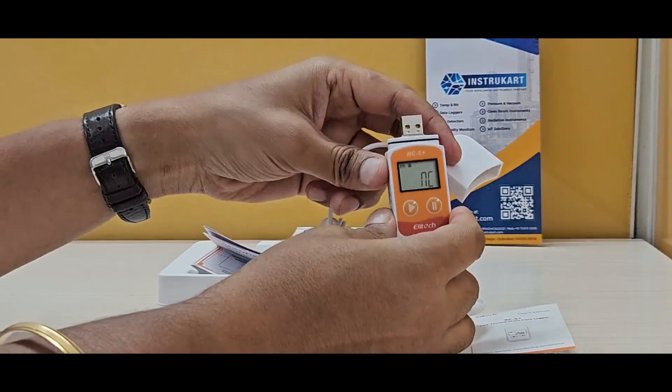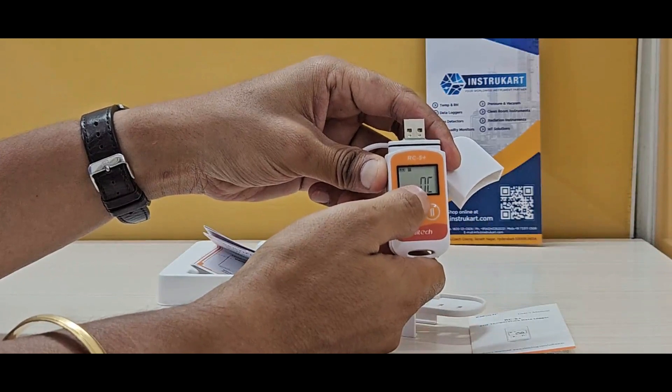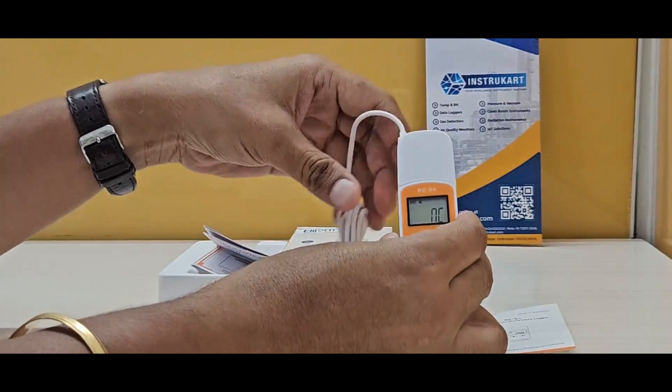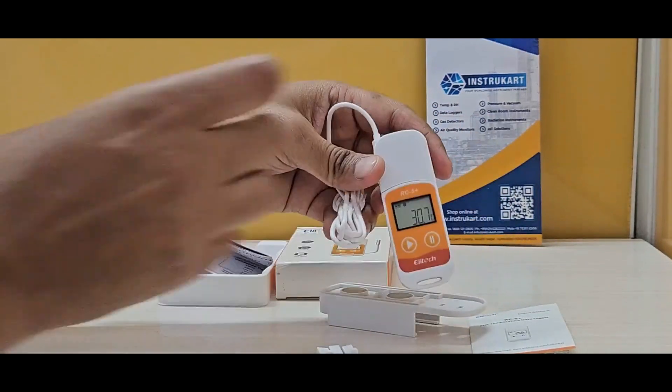When it is not connected, it displays 'NC'. However, once you connect it, it starts giving you the data online.